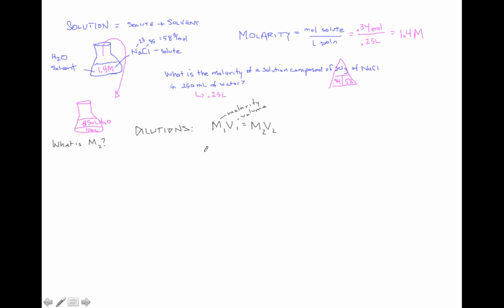So let's put the numbers in. The first molarity we established was 1.4 molar. The volume of that solution that I'm taking, we transferred 10 mils. Whoops. That's a 10. So I took 10 mils of that. Now, the units you use for molarity, for volume, just be consistent on the left and right because they'll cancel each other.